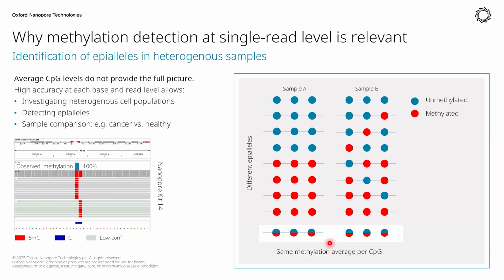Yeah. When you analyze your data, it's not just on a per read basis, but you will be looking at essentially a pileup of your data. On other platforms, that's really the only way to analyze your data. But what's really nice about the Nanopore platform is that you can look at all of these methylation patterns in the context of the reads that they're on. We're not looking at shorter fragments. We're looking at 5, 10, 20, 50, 100 kb long fragments.